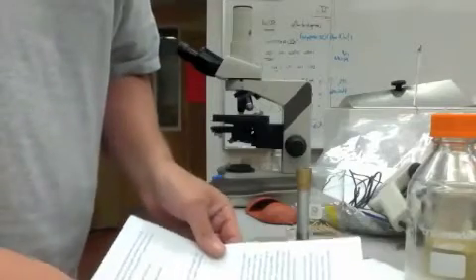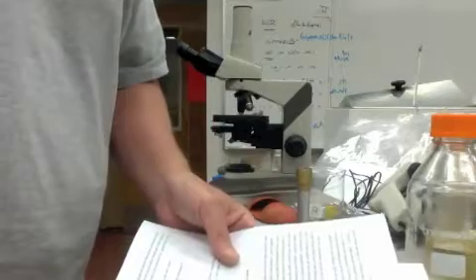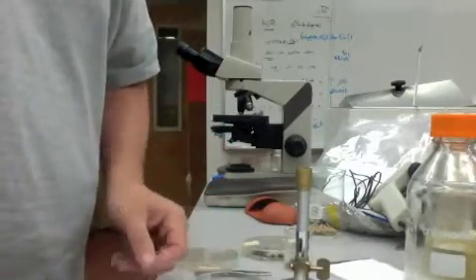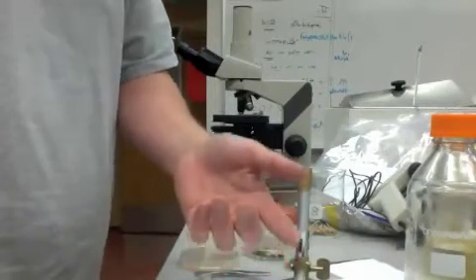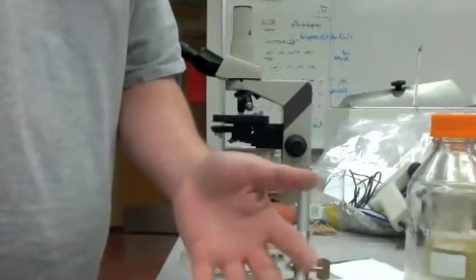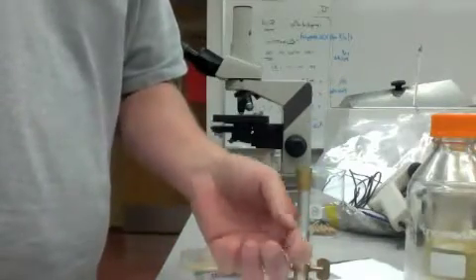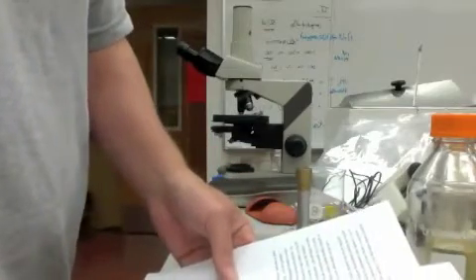Now I won't go through and demonstrate each of these, like your favorite, the rectal swab for E. coli. You can read those and figure those out. But again, it points out that you wouldn't go to get an organism that lives in the lower intestinal tract in ice cream or in a box of Skittles. You have to go to the site, and the site in this case is the lower intestinal tract of mammals.